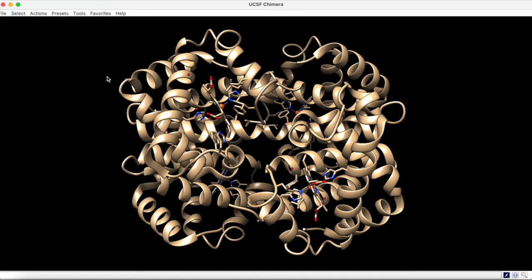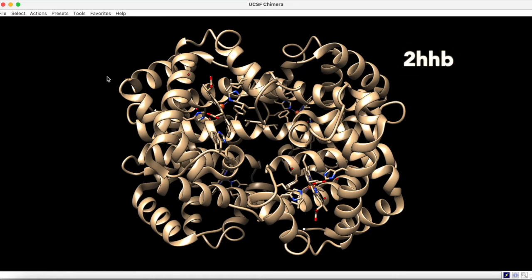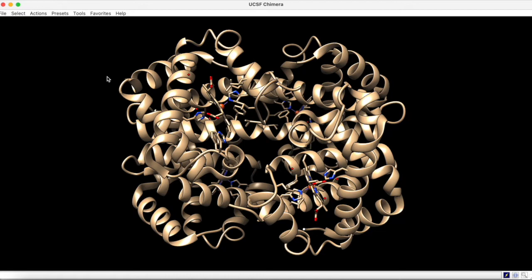What we have here is a hemoglobin structure with the PDB ID 2HHB. As you may know, hemoglobin contains iron ions. To locate these ions, we can select by chemistry.